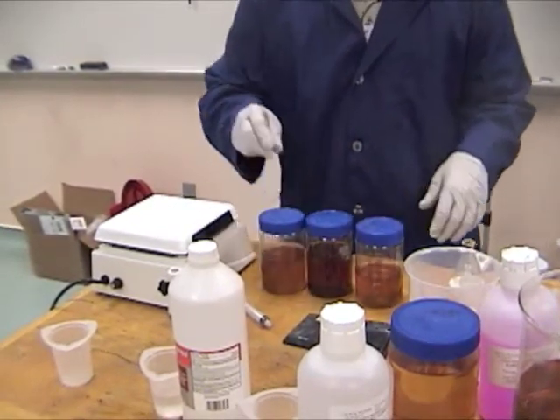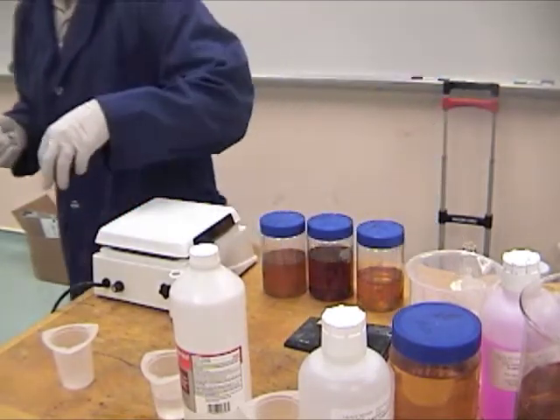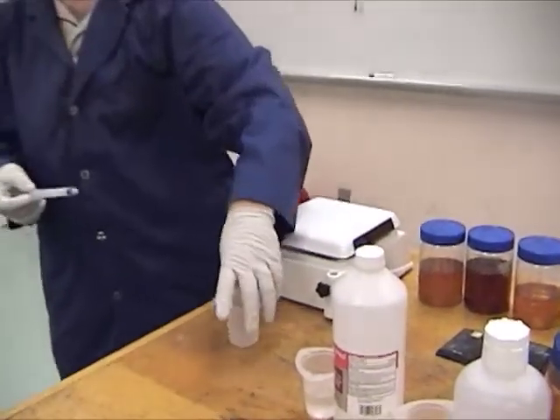Oil. I have no idea what kind they are. This is just a syringe. I'm going to use 10 mils of isopropyl alcohol in one of these.